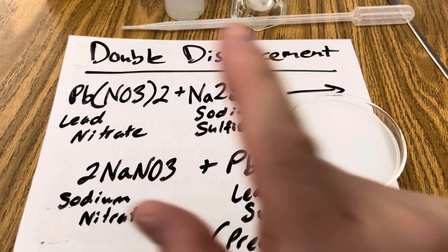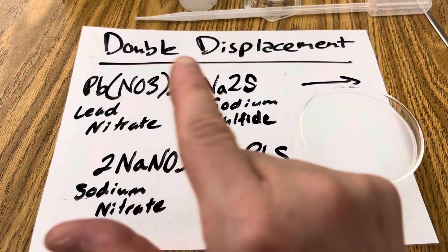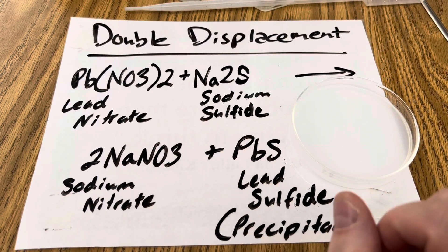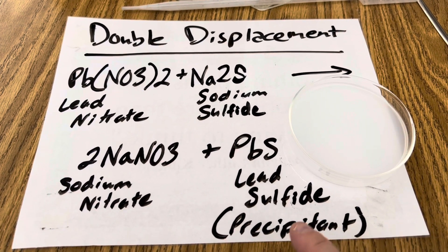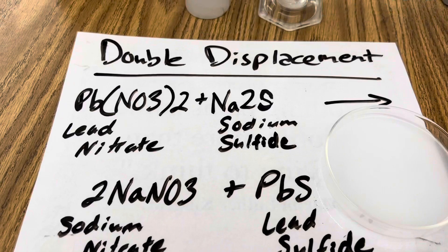So in this reaction, my reactants are my lead nitrate and my sodium sulfide. Remember in double displacement reactions, metals trade places with metals, non-metals with non-metals. So my lead is going to switch places with my sodium to create the products sodium nitrate and lead sulfide. Lead sulfide is the precipitant — it's going to be this very dark precipitant that's formed immediately when I combine the two solutions.